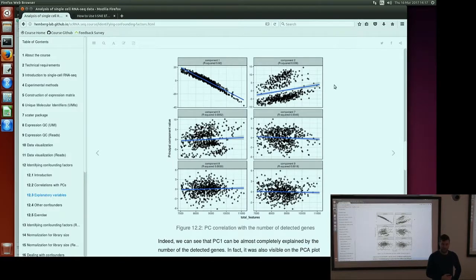So if it's a continuous variable, you see a plot like this, a normal scatter plot with a fitted curve. If it's categorical, then you'll see violin plots for the two groups. So that regardless of what the type of the variable, you'll get a sensible plot out that will show which principal components have the highest R-squared value for that particular variable of interest.